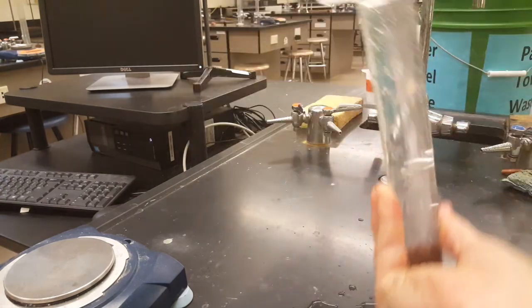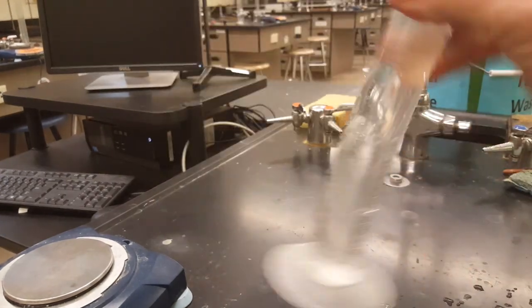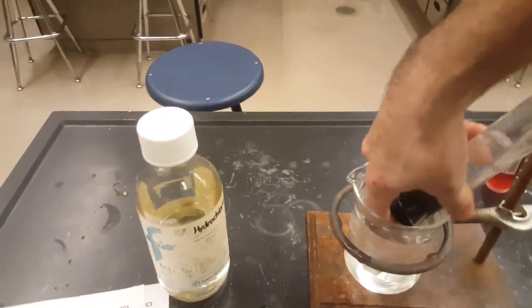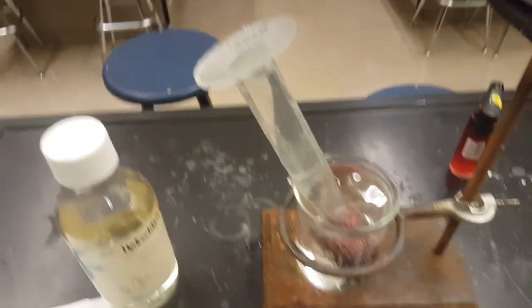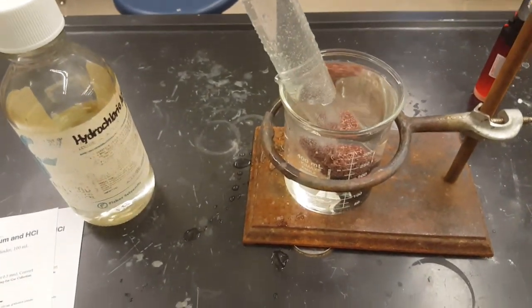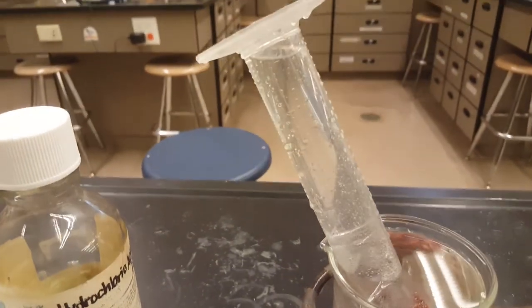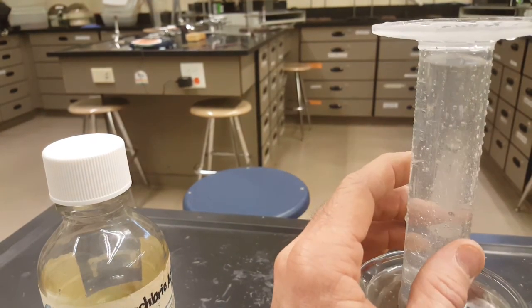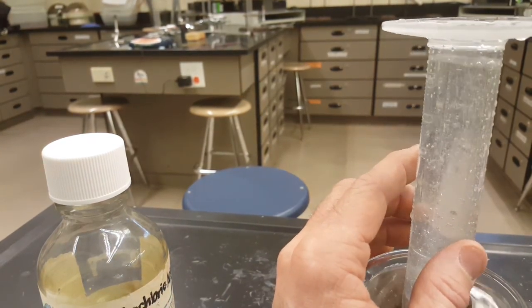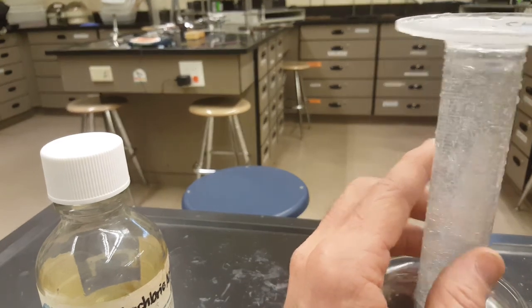mix it a few times, and then place it into your beaker. Now you can remove your finger once you've placed it into your beaker. The instant it's in there, this is the hard part. Air snuck in there. You can see that I'm making hydrogen gas, or what we suspect to be hydrogen gas.